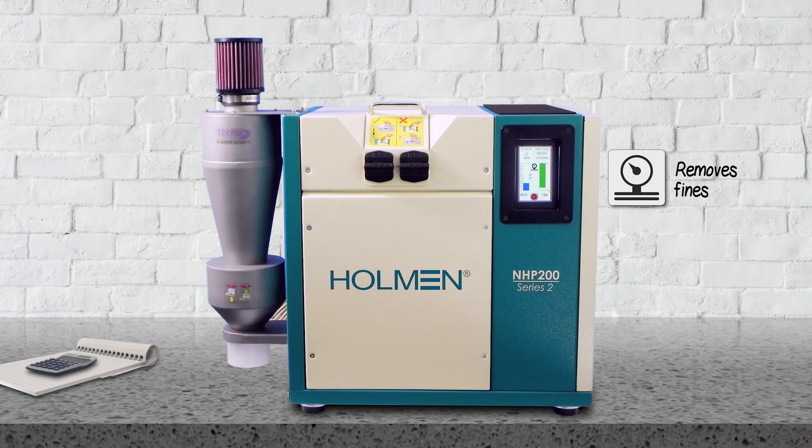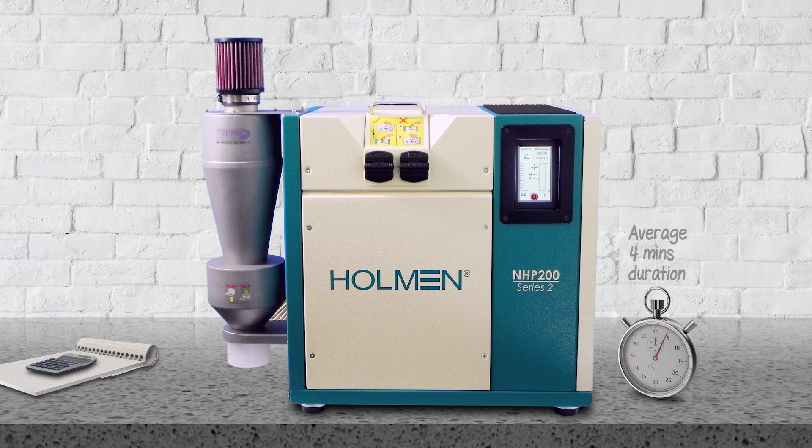It then removes any fines, weighs the sample again, performs the test, weighs the remaining sample, then calculates the PDI. This process, on average, takes about four minutes.